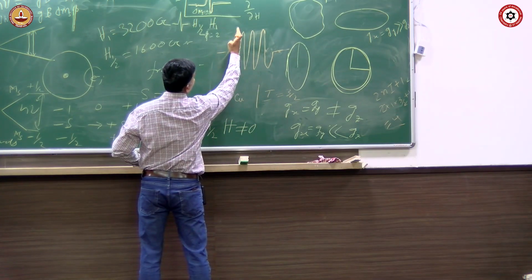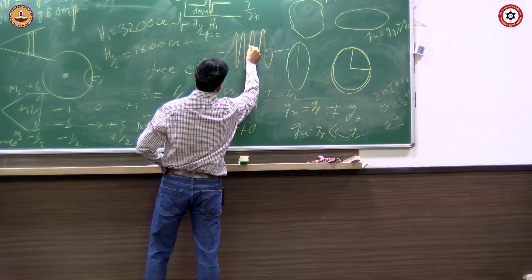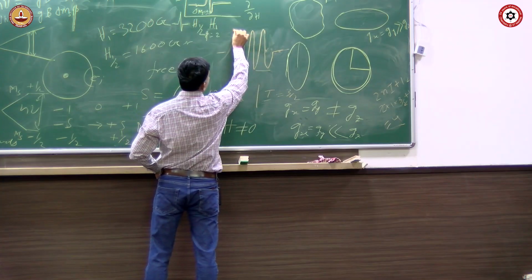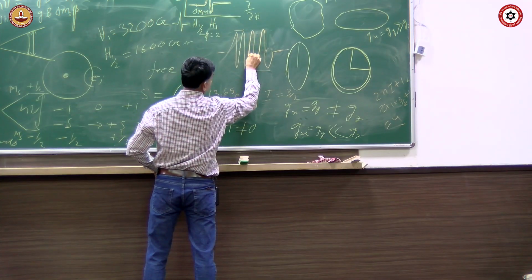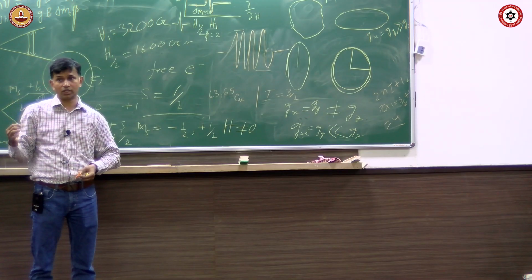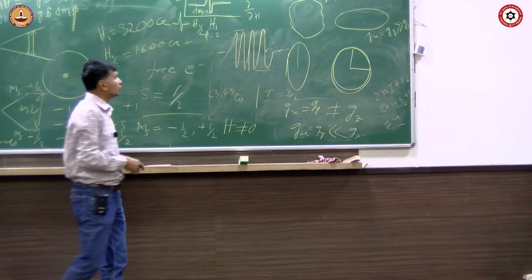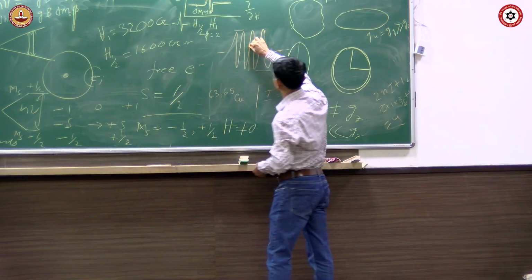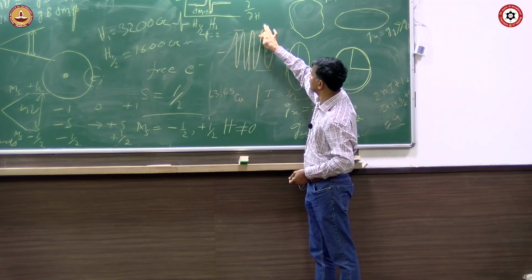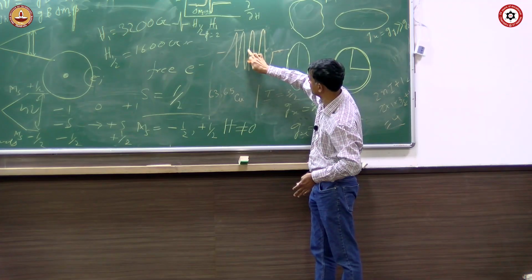You go peak to peak on this side and on this side, so somewhere in the middle is the center. This side 2 and this side 2, and here is the center. Locating the center is also a matter of perception, it's not so easy in a symmetry. You will feel the center is somewhere here. What you have to see is that exactly center inversion should be there.